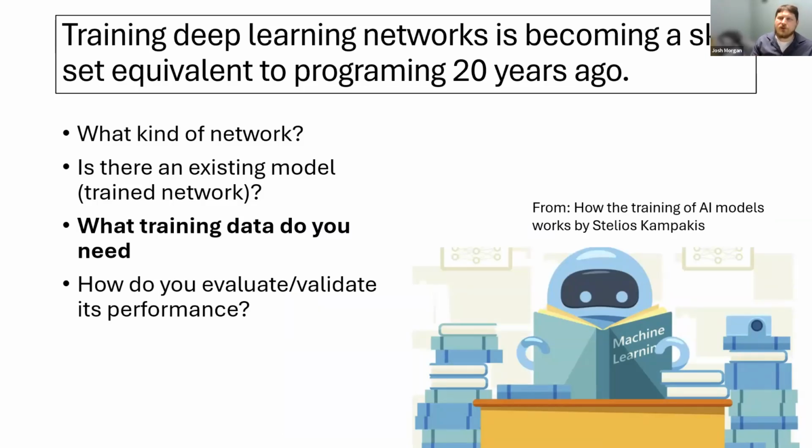And so that was with Scalable Minds a couple times. It's worked out reasonably well. And so they have a pretty fast turnaround when you contract them to do things? Yeah, it's been okay. For the large data sets, it might take us a month or two to acquire the data set, and maybe a month or two to get the data set back, and then a couple of years to analyze it. So if they're doing the alignment, that's definitely no longer a bottleneck in the process.